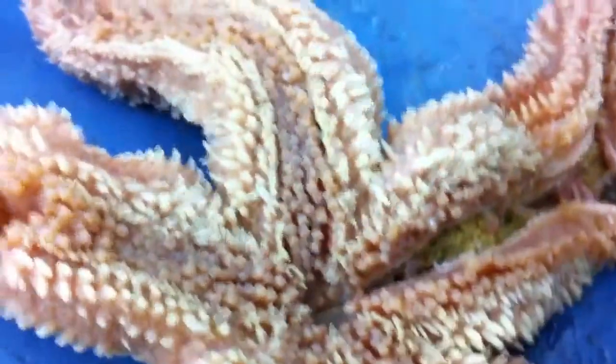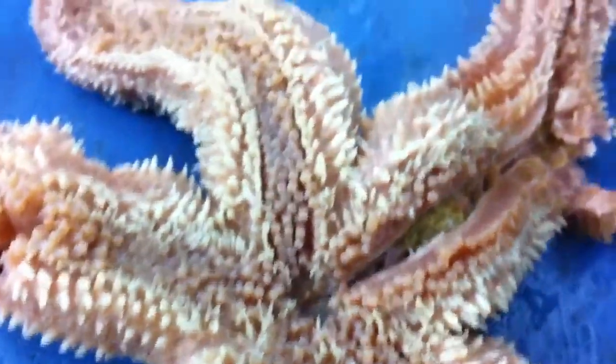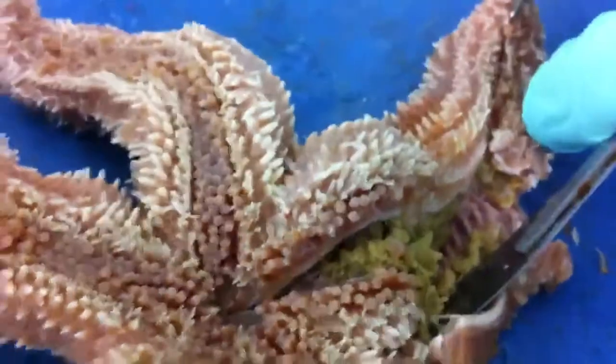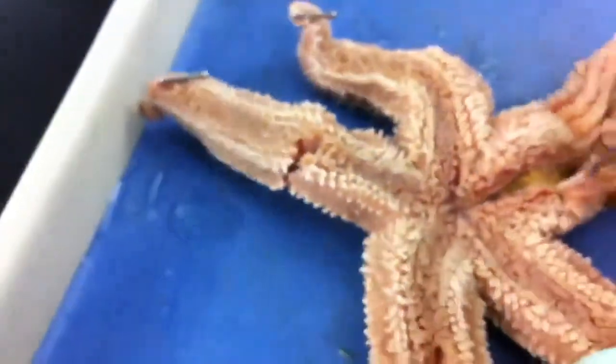That sounds crispy. Alright, pin this shit. Oh, nevermind, don't need to pin it. Cut this side so you can open it up easily. You should have cut here so you can open it up. Oh, cut it like right here? Yeah.